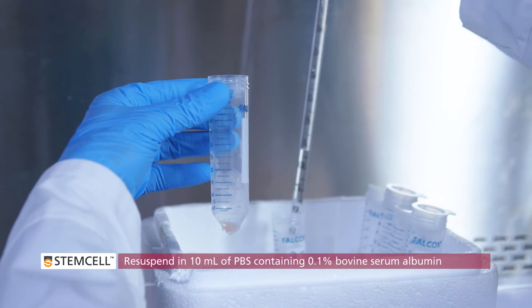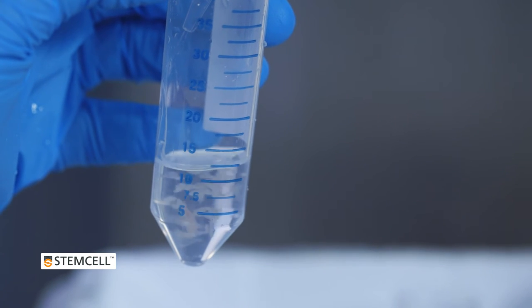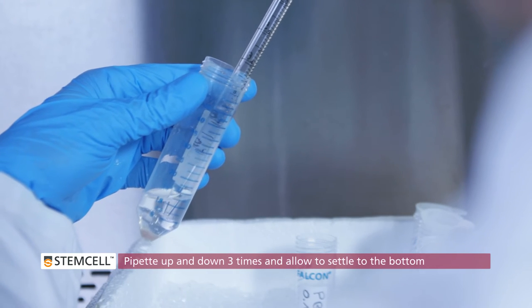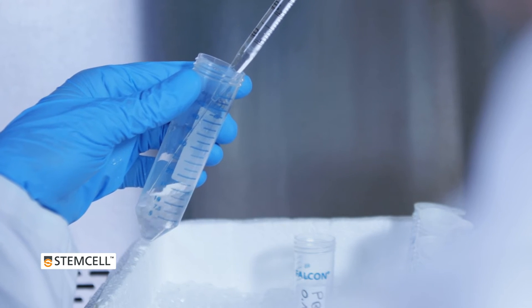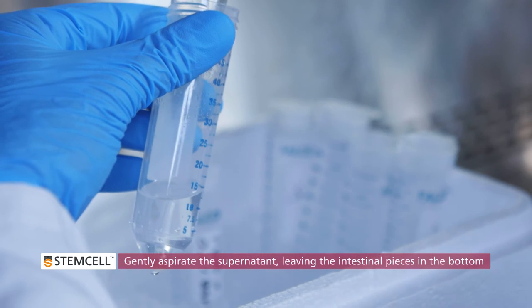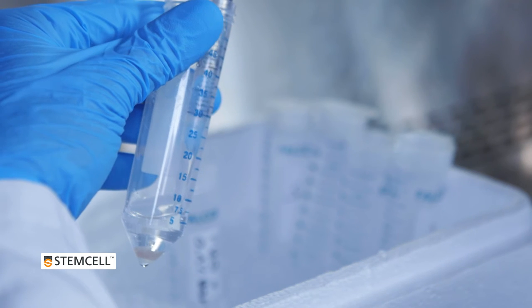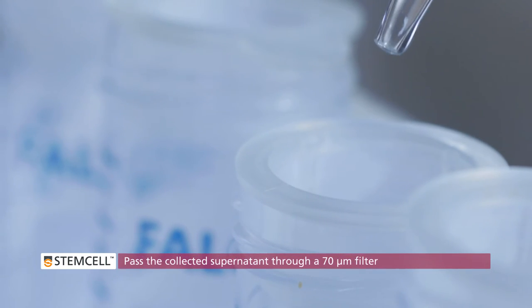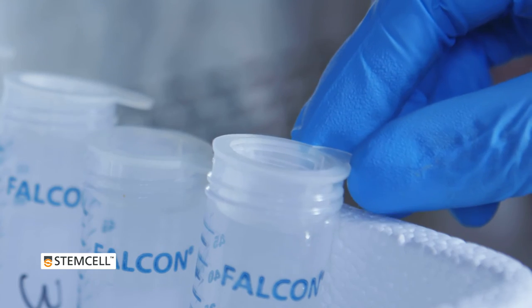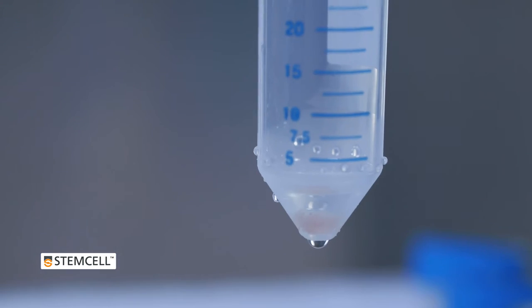Resuspend the intestinal pieces in 10 mL of PBS containing 0.1% bovine serum albumin. Pipette the intestinal pieces up and down 3 times. Wait approximately 30 seconds to allow the majority of the intestinal pieces to settle to the bottom. Gently aspirate the supernatant, then pass it through a 70 micrometer filter and collect the filtrate in a new 50 mL conical tube. Discard the filter and label the collected suspension as fraction 1. Place this fraction aside on ice.